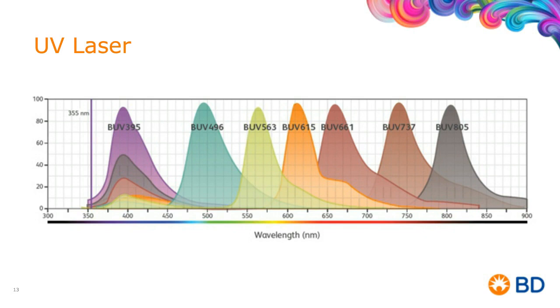As I pointed out on one of the earlier slides, the publication that Yolanda Mahnke and Mario wrote several years ago was the foundation for it. But really what they said was that the primary markers are those that are easily discernible between the negative and the positive, and which are highly expressed.